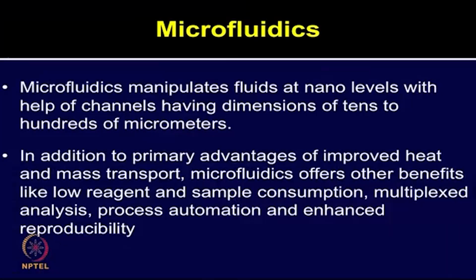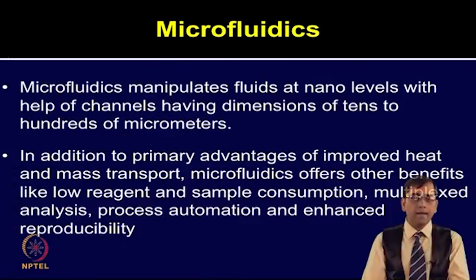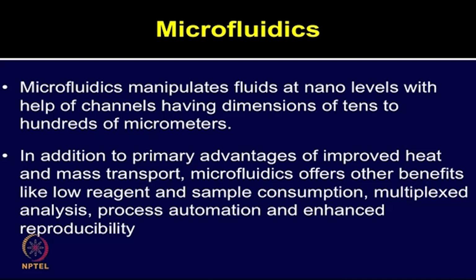Let us now discuss the next technology, which is microfluidics. Microfluidics deals with processing of ultra small fluid volumes with the help of 10 to 100 micron channels, which can provide sensitivity in the range of picomolar to femtomolar. Microfluidics deals with fluids at the nano level with the help of channels having dimensions of tens to hundreds of micrometers.